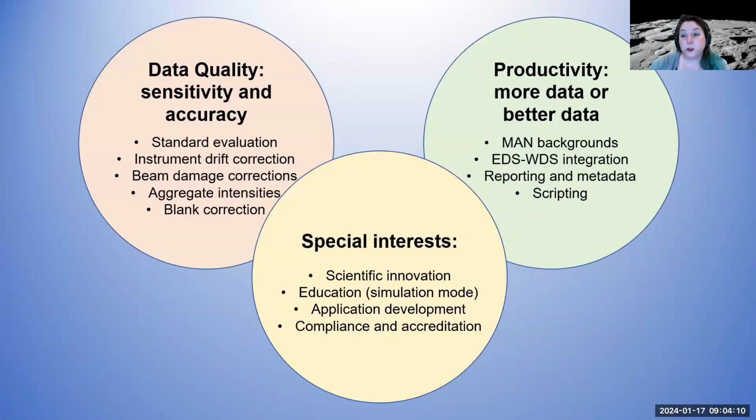Okay, so EPMA is a very versatile technique. We are using it to get excellent, high precision, high accuracy data with micron level spatial resolution. In a lot of departments it is really the start of the workflow in characterization of materials, and we still use it compared to something like scanning electron microscope based EDS, energy dispersive spectrometry, because we're interested in high data quality.